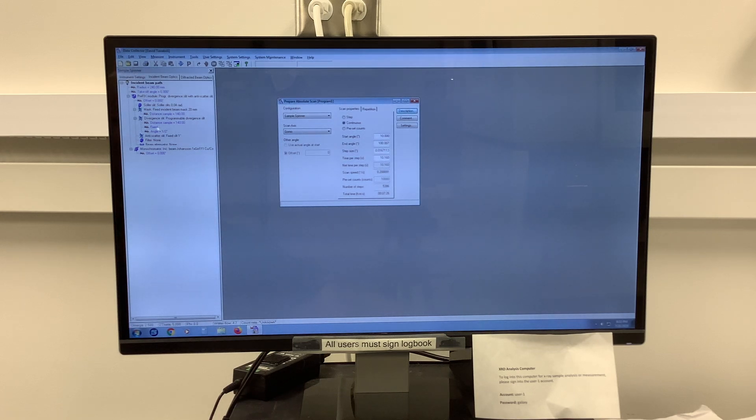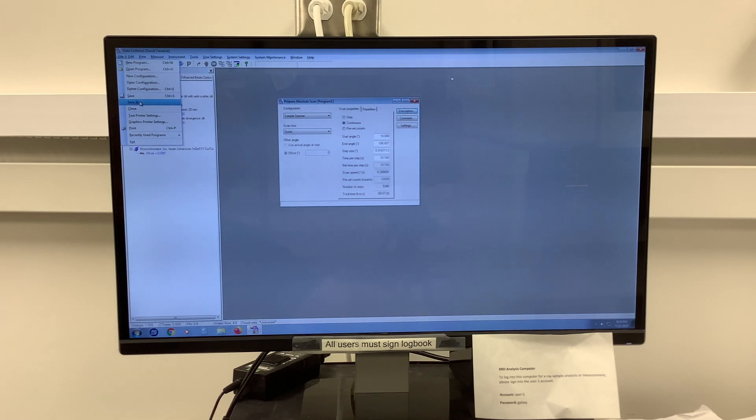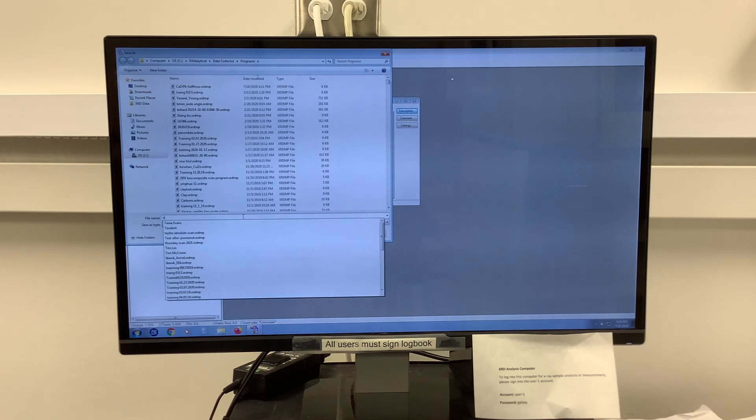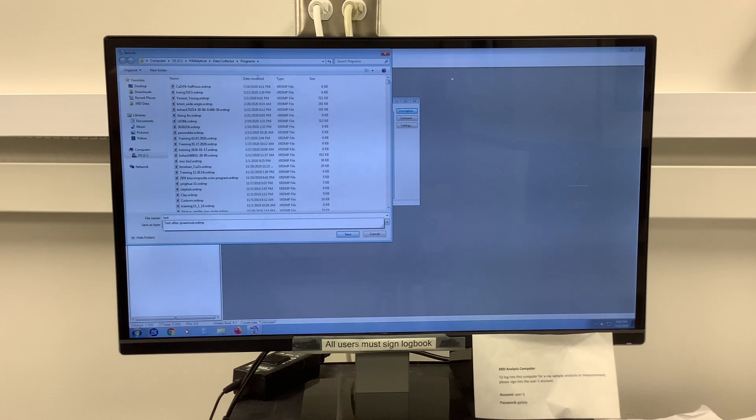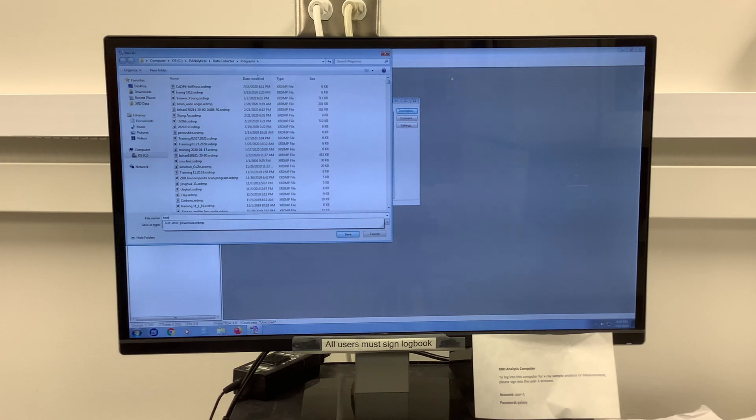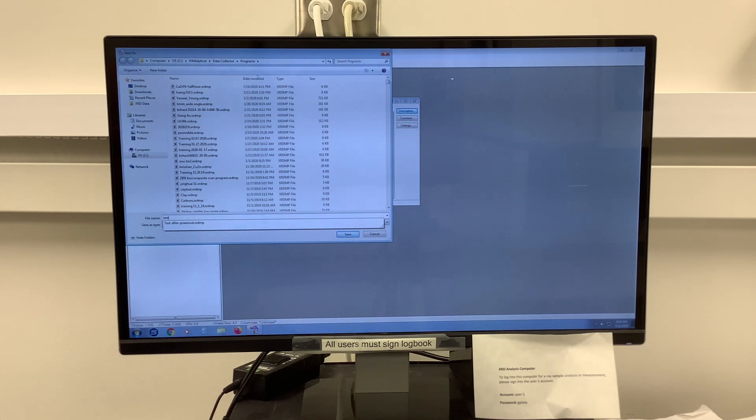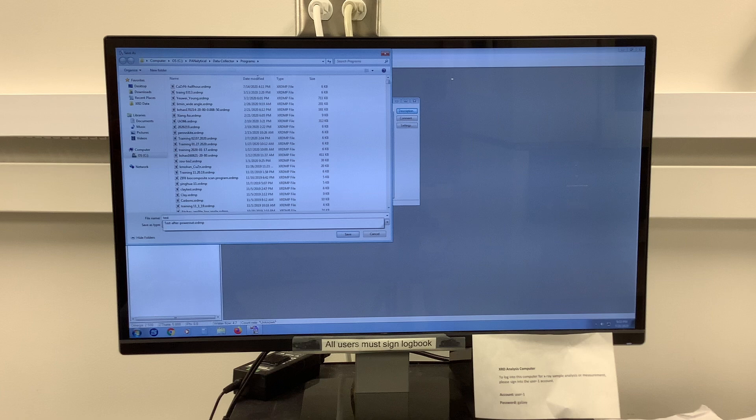To save my program, I'll say File, Save As in the very top menu. And I can call this program whatever I like, remembering that my program is just a generic name. When I run my program later, I can define my sample ID at that point.